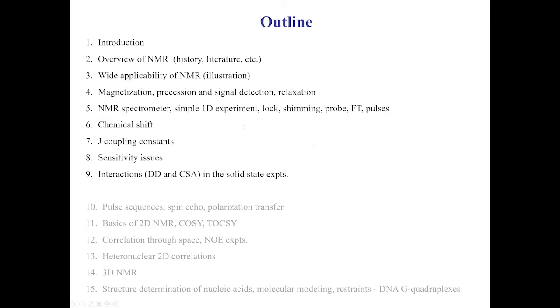A little bit we go to the spectrometer setup, although this will be nicely introduced by my colleagues, Primoz and Damian, along the school. I think we'll even have videos presented. We'll continue with the introduction of what is called chemical shift and the J coupling constant. I'll touch a bit on sensitivity, because typically issues come up when NMR is considered a method that is a little bit less sensitive in some cases, but I'll show you that this might not be the biggest problem nowadays.